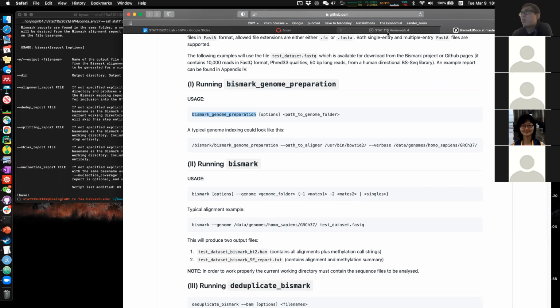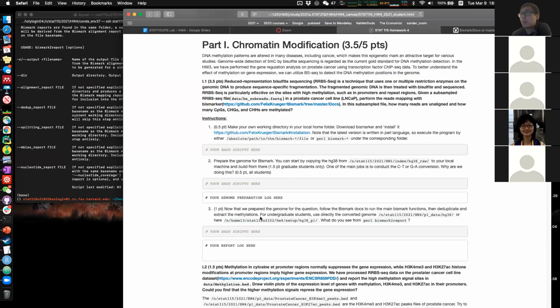Okay. For undergrads, or if you do not want to worry about this, we also provide a version here. That will be a converted genome version, and you can continue to work on the following questions based on this converted one. But again, I would highly recommend you check it out. Okay.